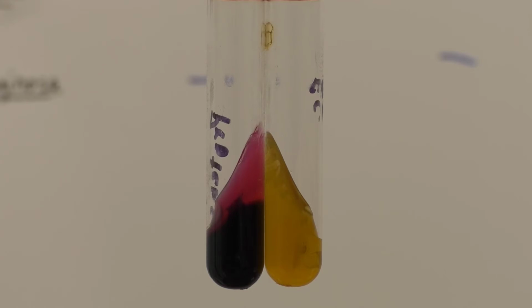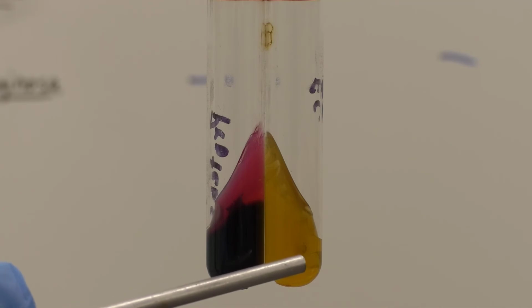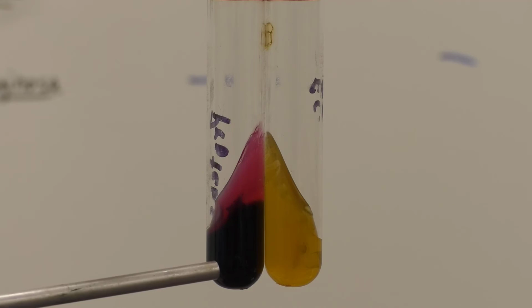So these 2 tubes illustrate some of the variety of reactions that you can get with triple sugar iron agar. On the left, that would be on your right, is E. coli, and it's fermenting several sugars, and both the slant and the whole tube is yellow, indicating more than 1 sugar has been fermented. Proteus is only fermenting glucose in this reaction, and it also produces hydrogen sulfide. You can see the black precipitate, iron sulfide.